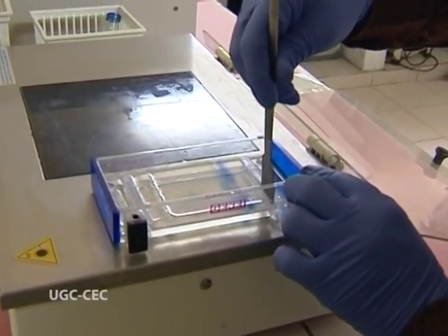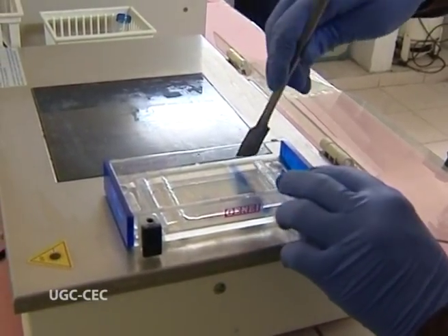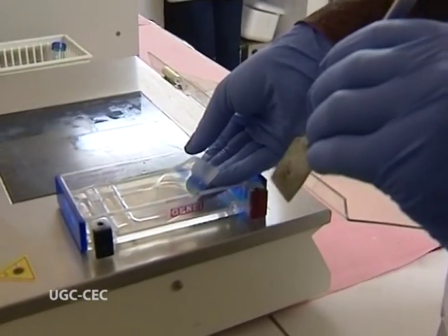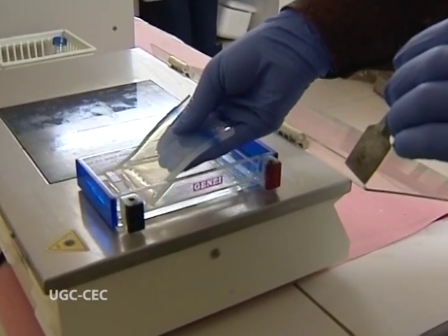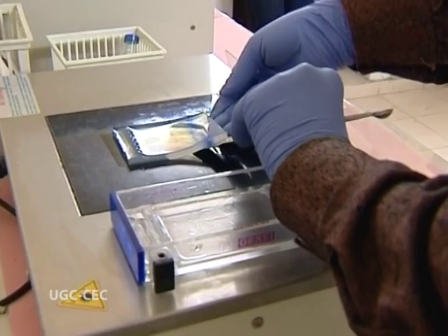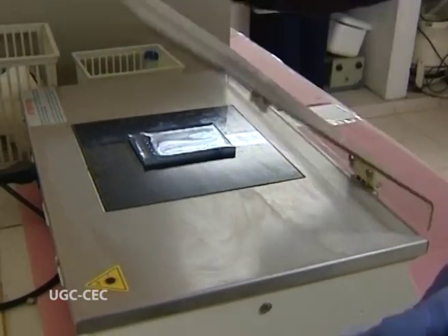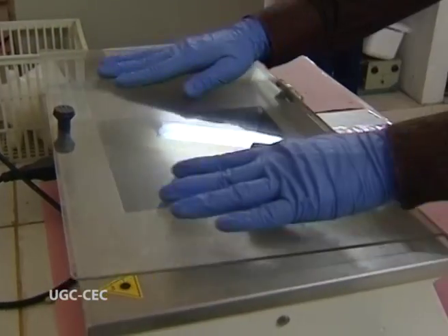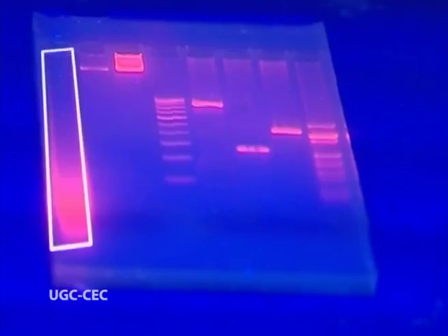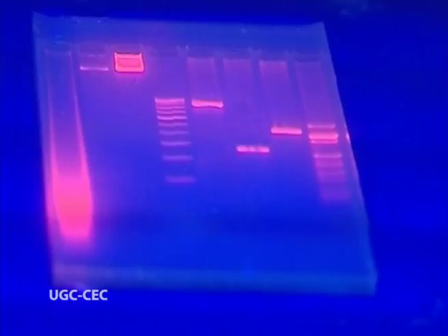Once the gel is run, we cut it thoroughly from all the sides with the help of a spatula. We place the gel from the casting tray onto the transilluminator. Once the light is passed, we see the bands. Now in this gel, the first three are DNA products, from which the first one is a shear DNA. You can see a trail of orange color behind the specimen.